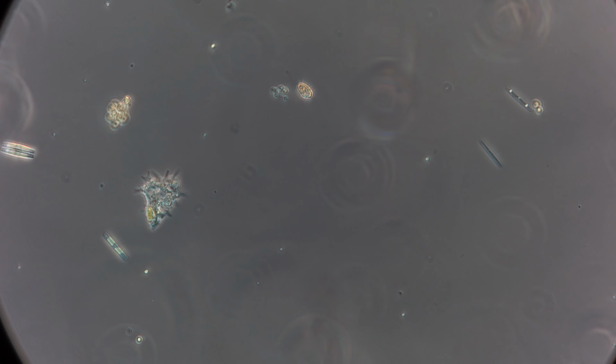This amoeba is nice. You can see this amoeba has eaten a plant. It's got green in its belly. This guy's going kind of slow. I think that's its flagella.